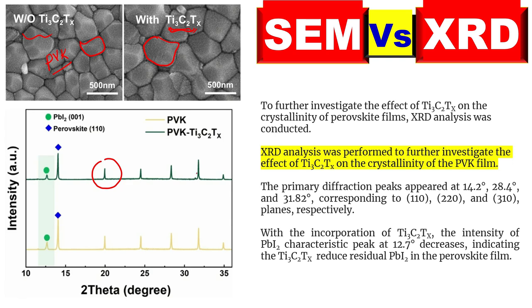How do we know that? We know from the main peaks. For example, one peak here, another peak here, and another peak here — labeled 110, 220, and 310. They are located at 14.2 degrees, 28.4 degrees, and 31.82 degrees respectively.